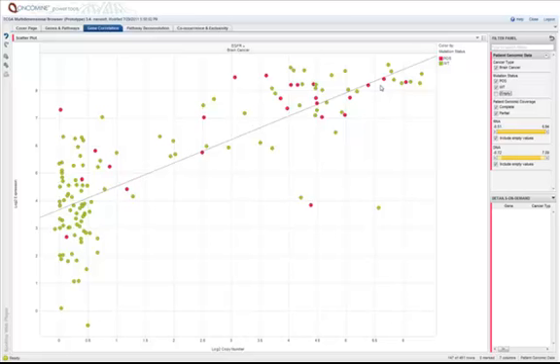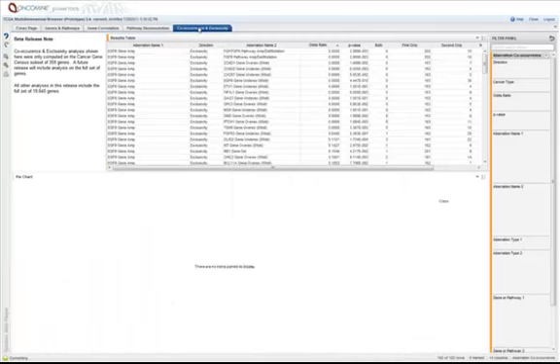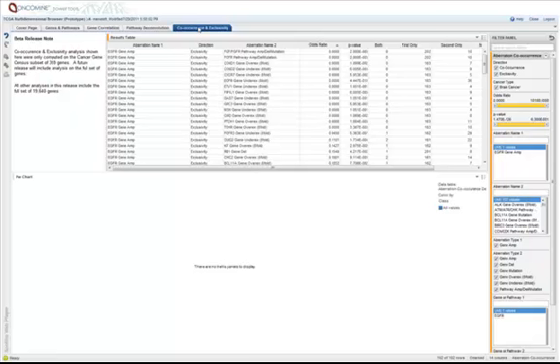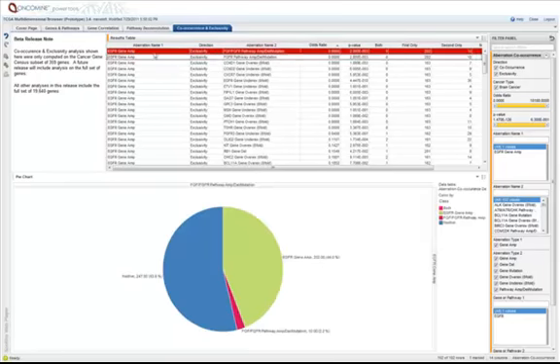So the last thing that we're going to look at is the co-occurrence and mutual exclusivity analysis. So now we're asking the question, for the EGFR gene amplification, are there other molecular events that occur in a mutually exclusive or co-occurrence fashion? And what we're looking at here is we're sorting by mutual exclusivity first. And what you can see here is that we're getting a statistically significant association between EGFR gene amplification and FGFR pathway amplification, deletion, or mutation, suggesting that these two events are mutually exclusive.